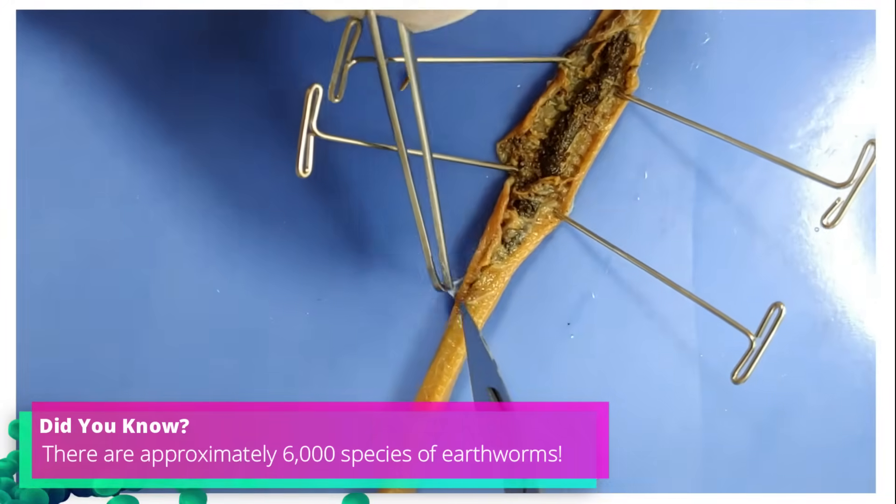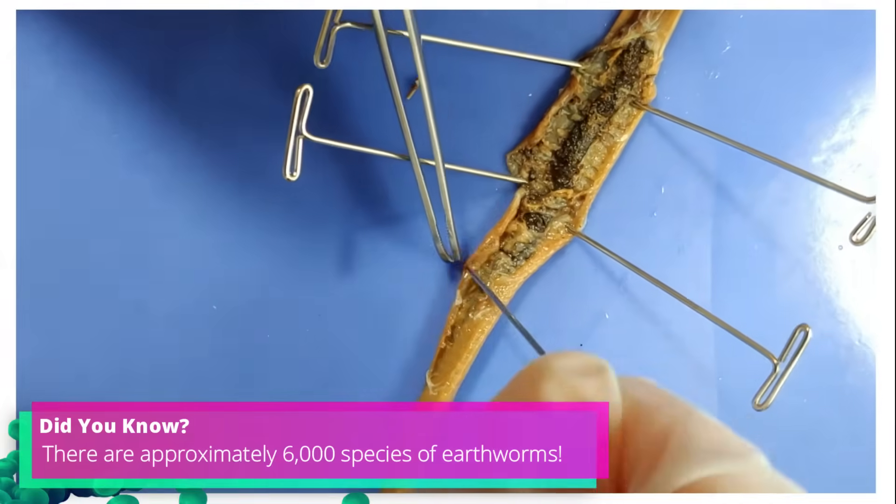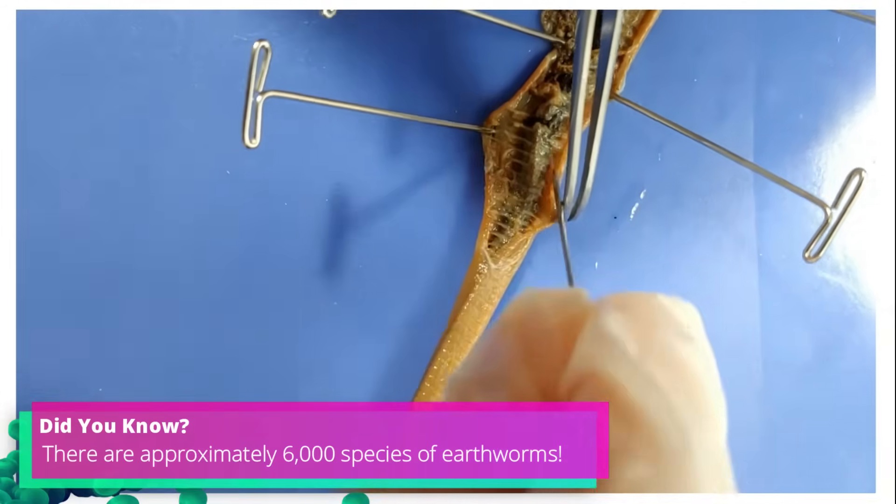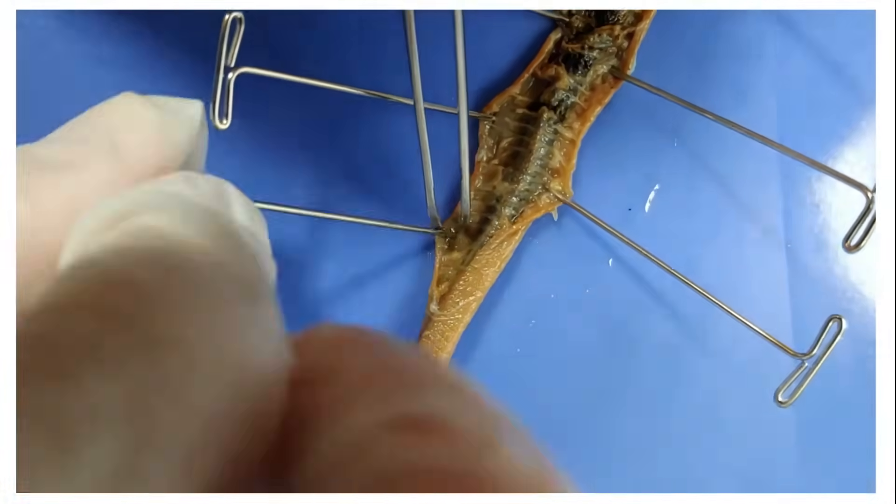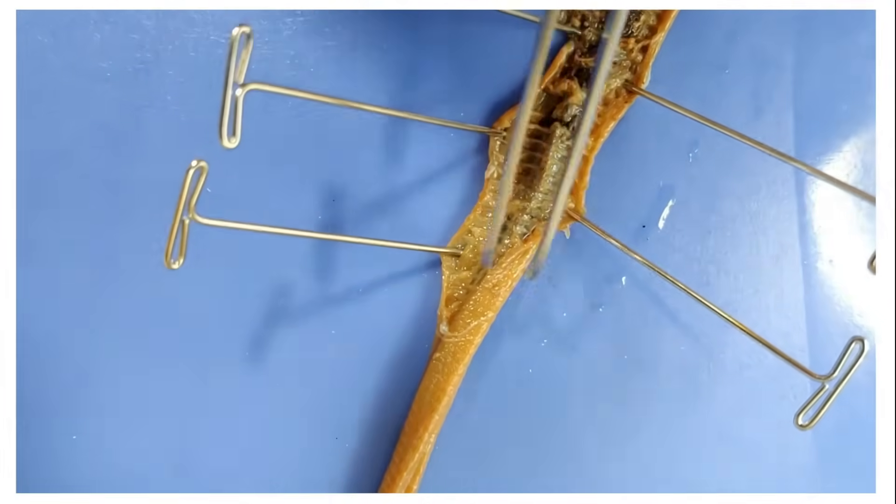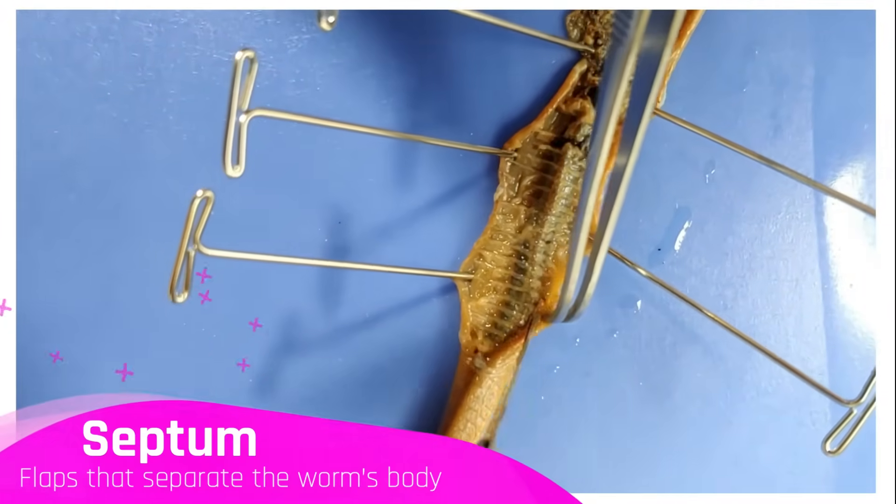Now worms are segmented animals and when I make the cut you can see that there are these flaps attached to the skin that divide the worm into segments. These flaps are called the septum.